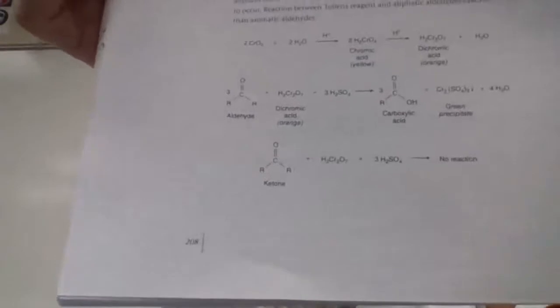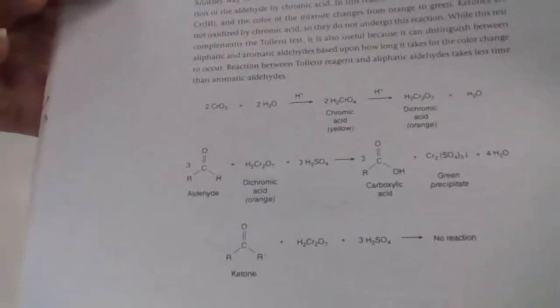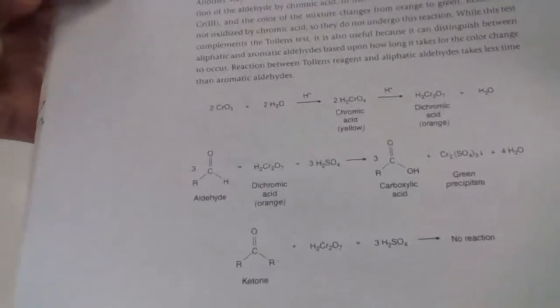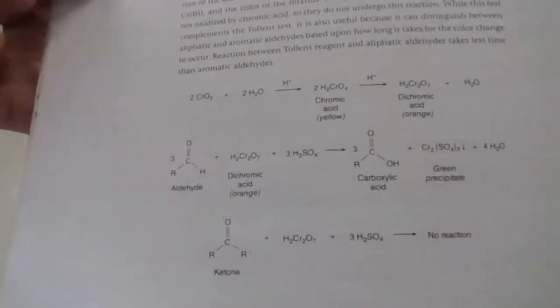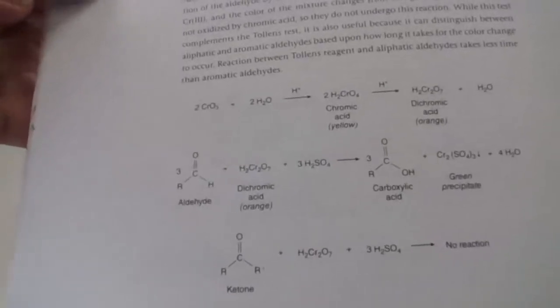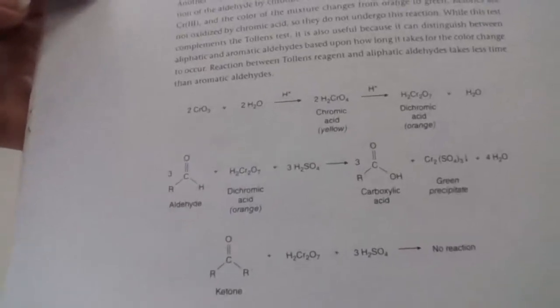If the compound is an aldehyde, you're going to get the aldehyde oxidized using chromic acid, because chromic acid also is a strong oxidizing agent. It is going to oxidize the aldehyde, but chromic acid is not going to oxidize a ketone. So if the test result is negative, that means your compound is a ketone. If the chromic acid test is positive, it means your compound is an aldehyde.